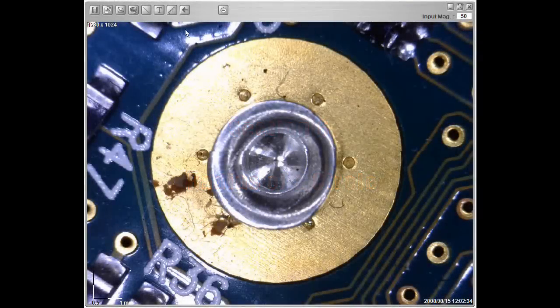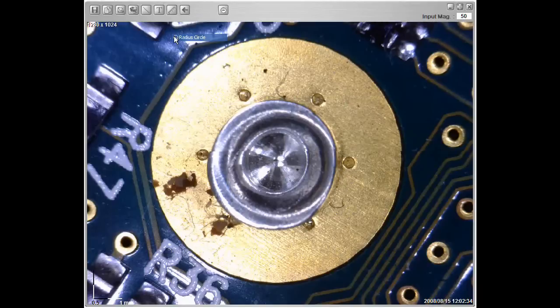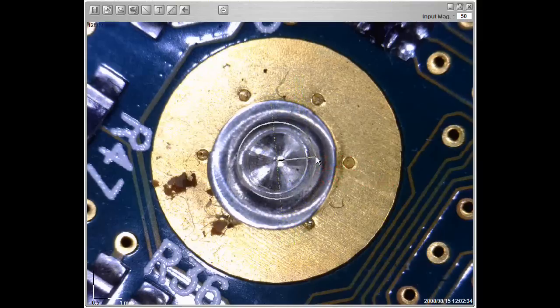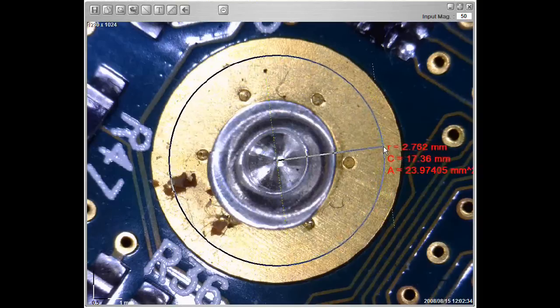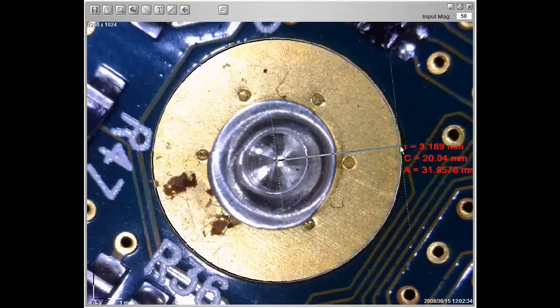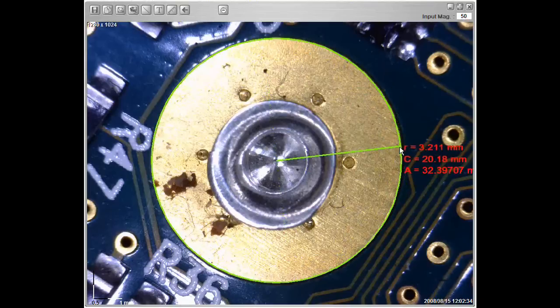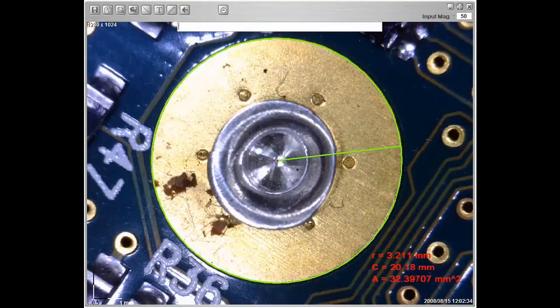Select radius circle to start measuring the radius of a circle. Start measuring from the center of the circle, then end the measurement at the desired location. Lastly, place the results of the measurements.